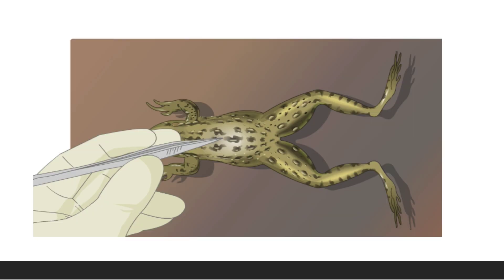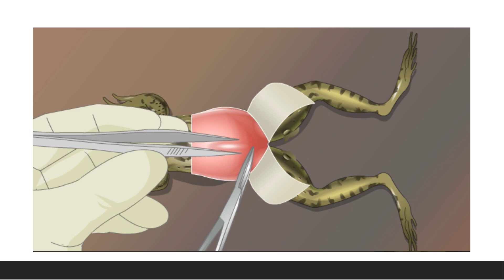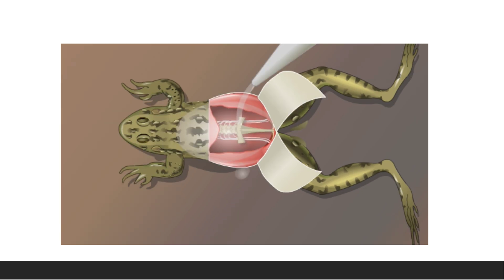First, place the frog in the prone position and give a circumferential skin incision at the middle of the trunk and strip the skin till the limbs. Then cut through the muscles alongside the urostyle and extend the incision upward. In this way the vertebral column can be found. Take care not to injure the underlying sciatic nerves. Using scissors, cut the lower end of the urostyle.